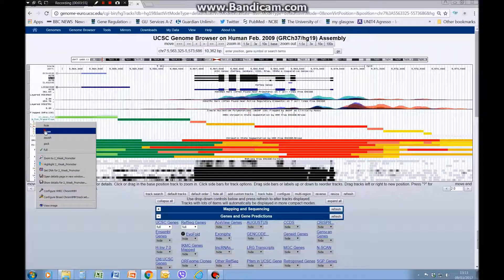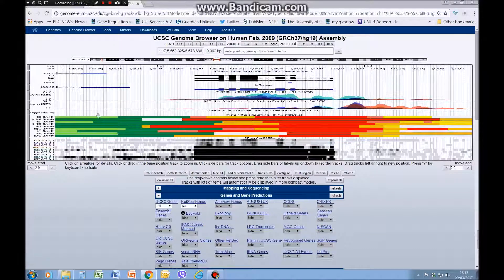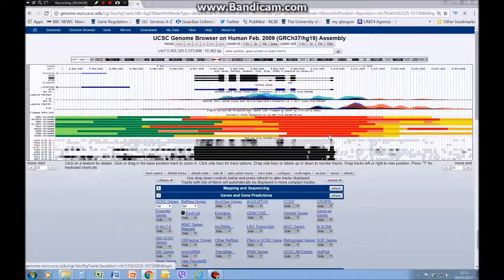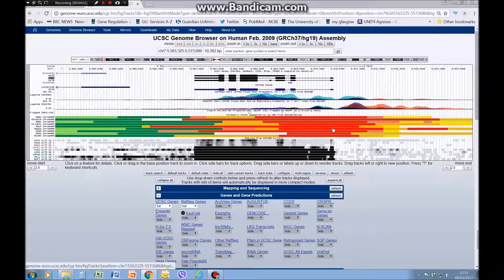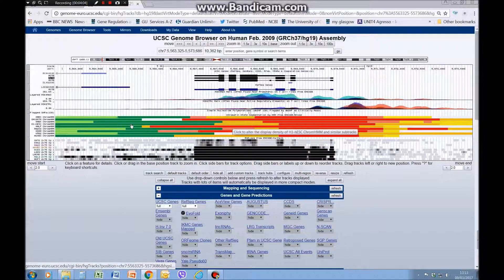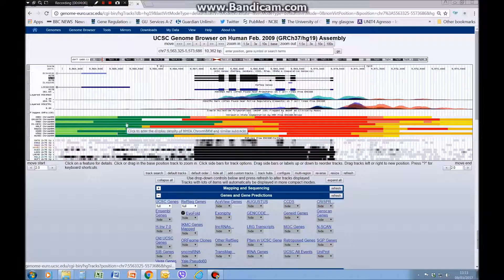We'll just put that back to dense so you can see in all these cell lines it predicts that this is a promoter region. We have some enhancer sequence here, then green is transcribed.